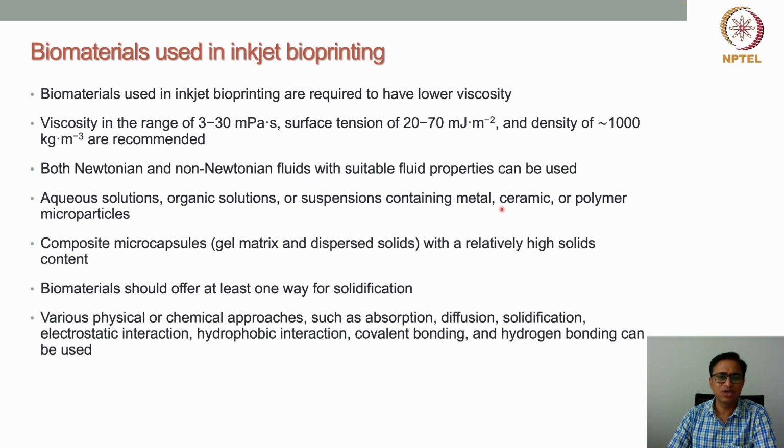We can use different types of solutions and formulations with inkjet 3D printing technology. We can use aqueous solutions, where the material is dissolved in an aqueous medium, like some hydrogel or any aqueous solution. Similarly, organic solutions, where the biomaterial or pharmaceutical material is dissolved in some organic solvents, are also possible.